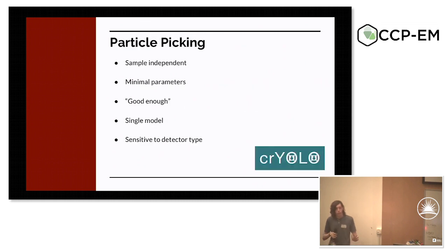Now, where we diverge from the RELION pipeline as built by CCP-EM and Sjors's group is in the particle picking. So the default in the RELION pipeline is using the Laplacian of Gaussian followed by template-based picking. And if your grids are really good, like I'm imagining the grids that this was tested with at the LMB, it works fantastically. I found the grids that some of our users brought for data collection were not quite so good. So we needed a more robust pipeline that could deal better with the amount of junk that some of our users brought.